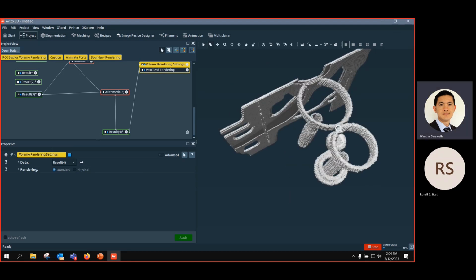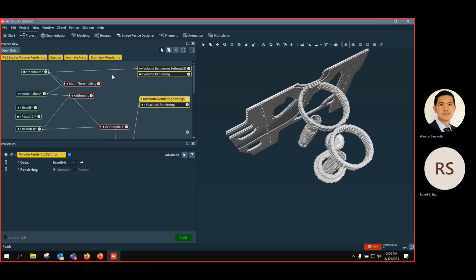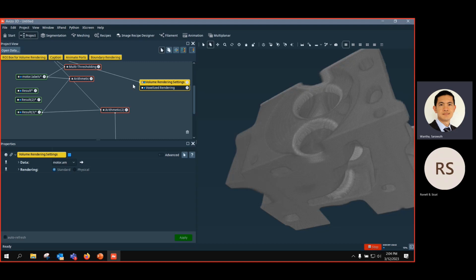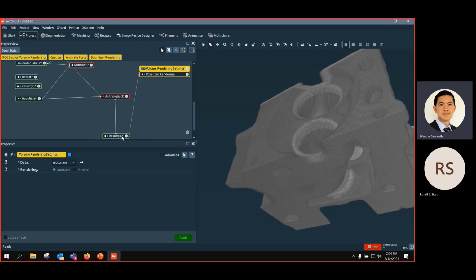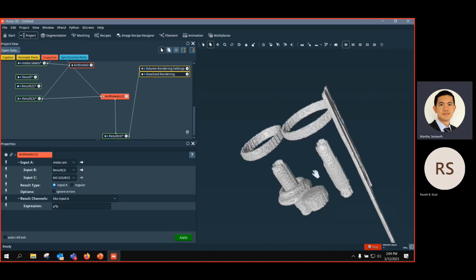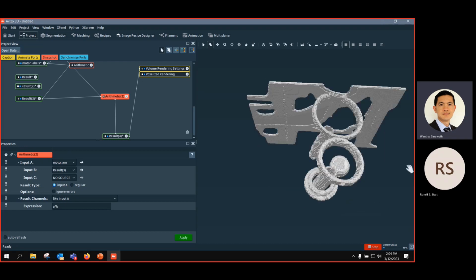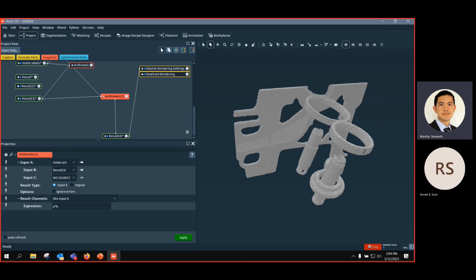So this is a grayscale image that's been masked. Before, it was a full grayscale volume, but after masking with material 3 using the masking function in arithmetic, we can create this mask. It's also something that could be interesting. Sometimes you want to create a search region of interest in masking.